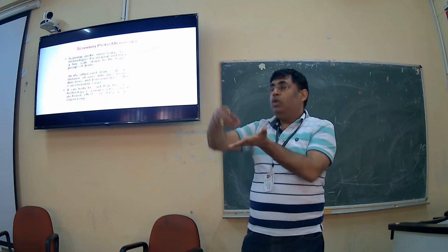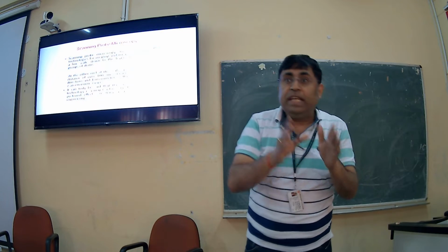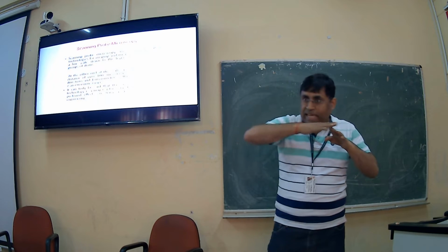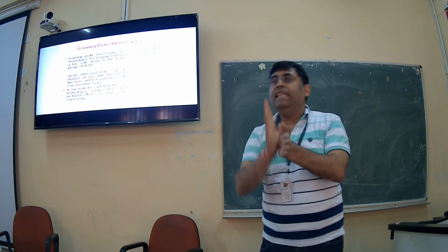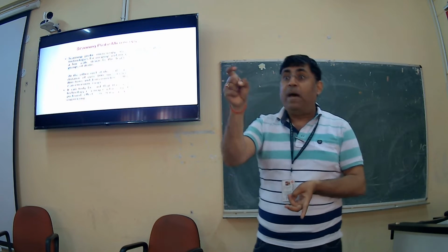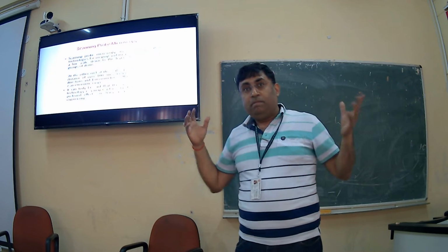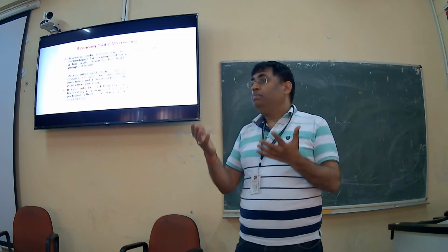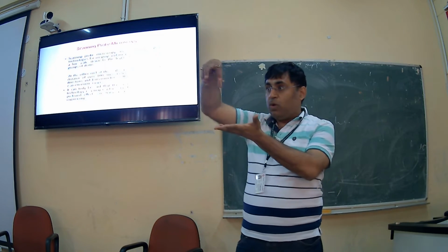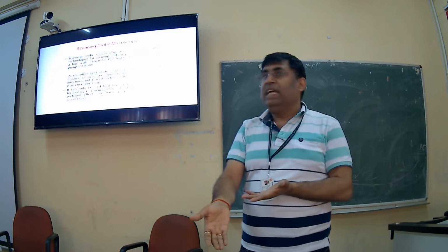Using a probe, you will scan the surface so that you can get information in all three dimensions: X-axis, Y-axis, and then Z-axis. That's the beauty of scanning probe microscopy. Because a probe goes there, I told you that a rover was sent by spending so many millions of rupees. A satellite going up cannot just take a picture; no, you need to go there physically.